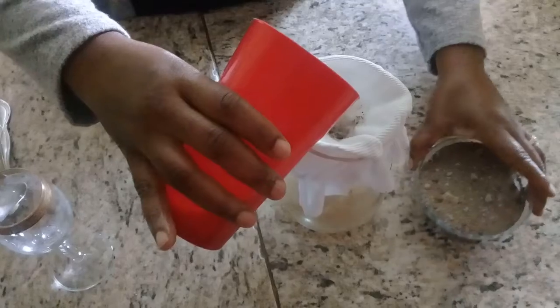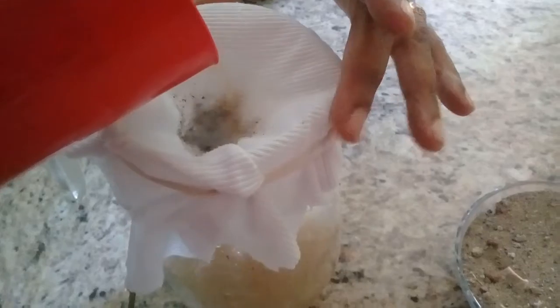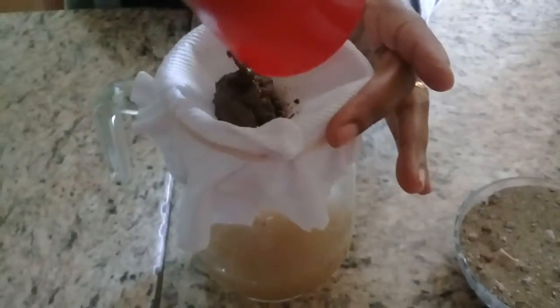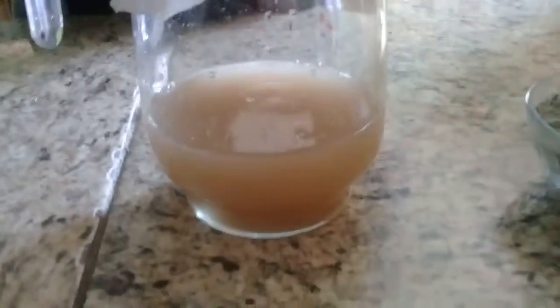Notice that what is coming out into the jar is just the liquid. If you notice on top here, the insoluble material, which is the sand, remains in the filtered material. Do we notice that? So all the sand has remained in the filtered material.